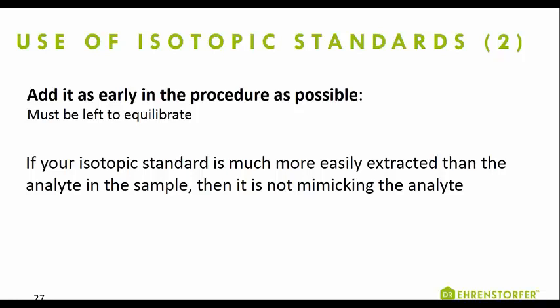There's no point adding an aqueous solution onto a sample of fat. Then it needs to be left for the internal standard to absorb as much as possible whilst the solvent evaporates. As a general rule, you should be adding less than 200 microlitres, but this will still take 30 minutes or more. Only then do you add your extraction solvent and start the procedure.